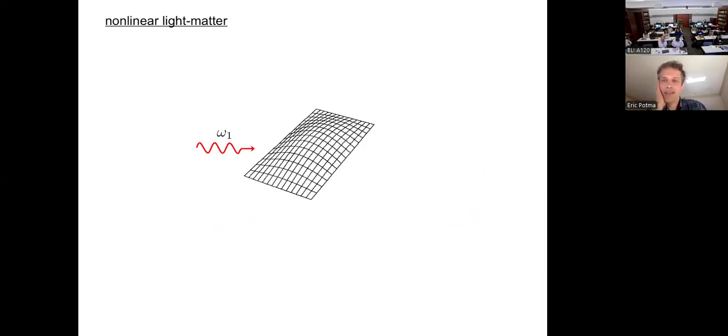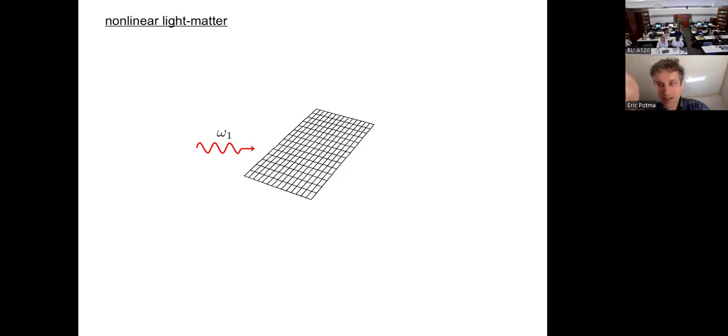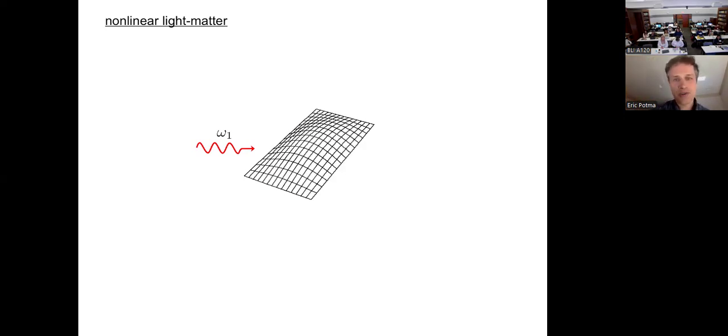And one way to go about it is to think about nonlinear interactions. Now, this is kind of strange because I just told you maybe 5 minutes ago that linear absorption is actually fairly inefficient. And now I'm going to talk about nonlinear interactions. So we go from linear to nonlinear, and supposedly that doesn't make things a lot stronger. And that is true. Nonlinear typically is a lot weaker than linear. So what is the reasoning behind this? Why would we make things more complicated? The reason is that even though it's weaker, there are situations where it can be still pretty strong, and the contrast that you get is actually kind of unique. It can be extremely beneficial for your experiments.